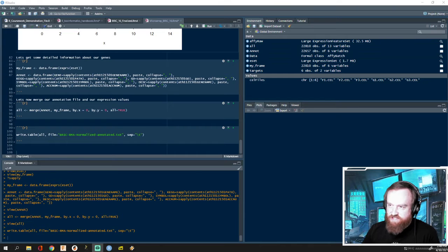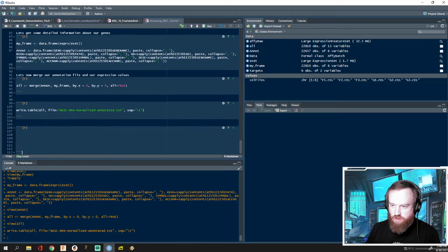All right, let's finish up our microarray experiment here. So the first thing we're going to do is create our groups that we loaded in with the file before, our targets, so it can be read by limma, which is our differential analysis package. So we're going to call groups, and that is our targets, and it's the second column.